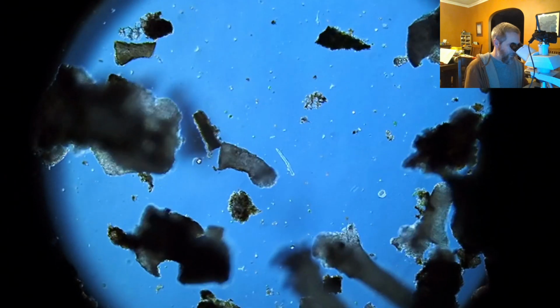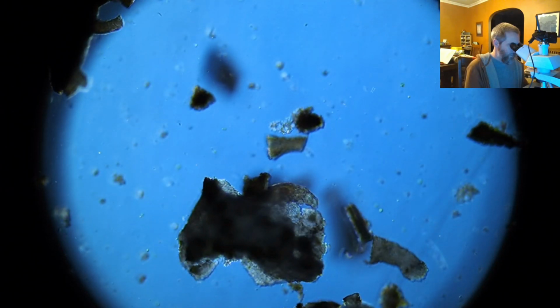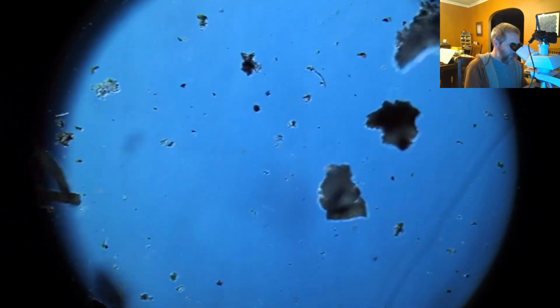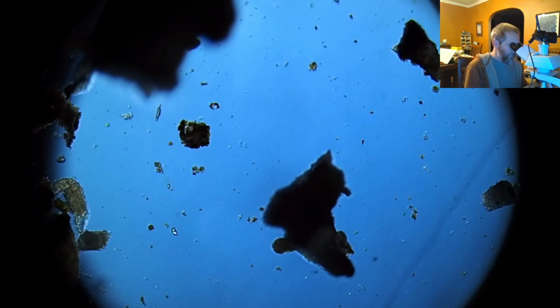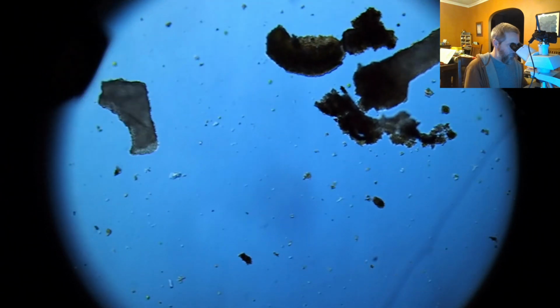Where'd the little water bear go? He was in this view. Oh, here he is. Here's one, crawling around, as usual. The other day somebody asked me if I'd seen any testate amoebas, and in the sample I had there were a bunch of Arcella testate amoebas, which I found almost immediately after they asked. I think that was OpenSet that was asking me that. But I haven't seen any in this sample. Those are also another organism that we come across in these samples quite frequently.